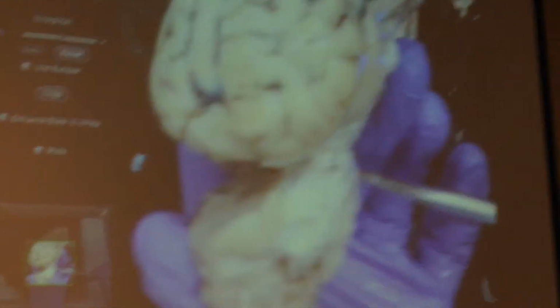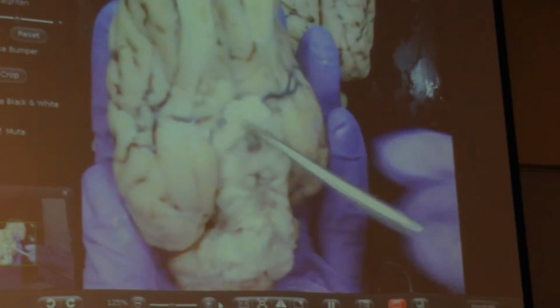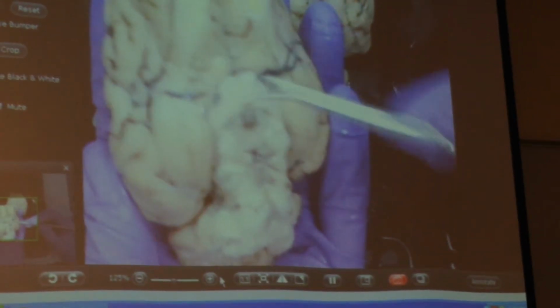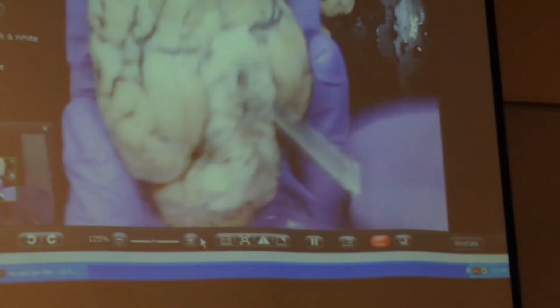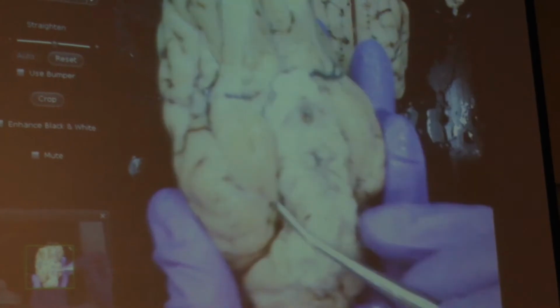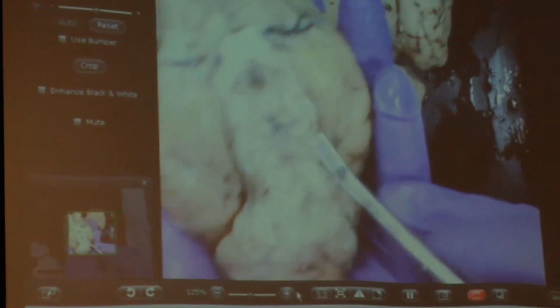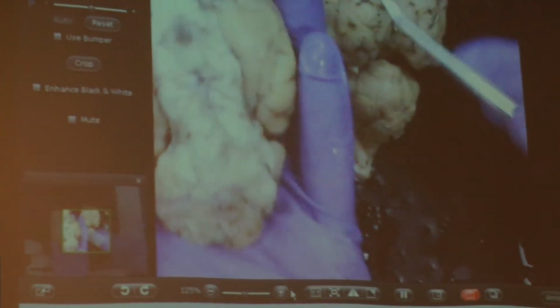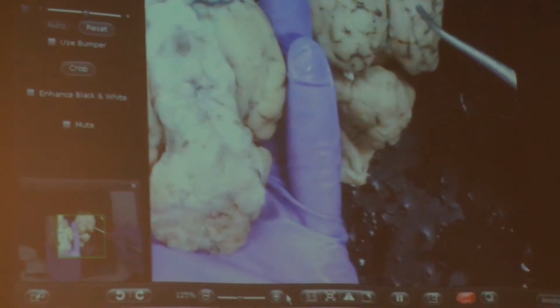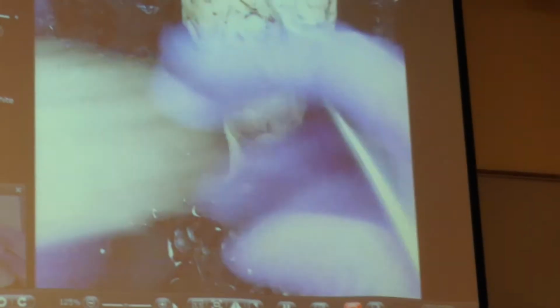The midbrain. Then I see, here's my optic chiasm, really cut close, right? On here, this would be my third ventricle. And then can you see these little structures that are coming off, right? Like right here, all of these little structures. What are those? Those are cranial nerves. Cranial nerves. Very good, Aaron. Cranial nerves.